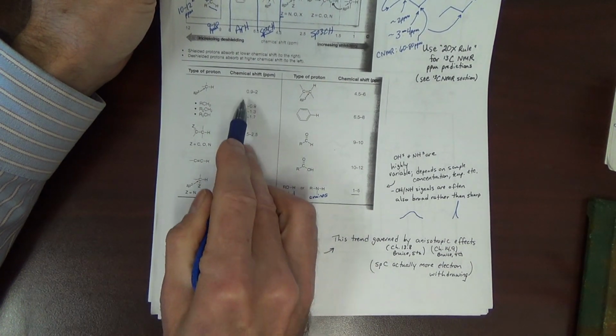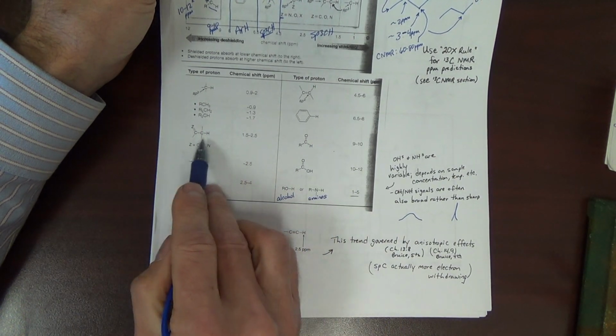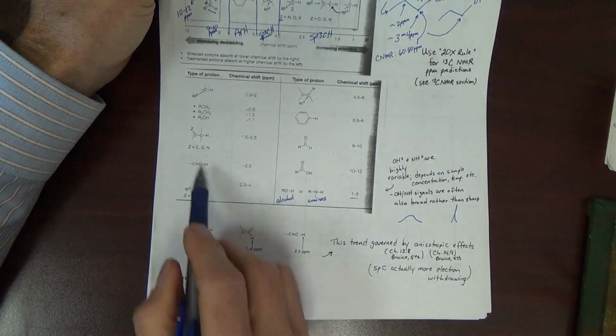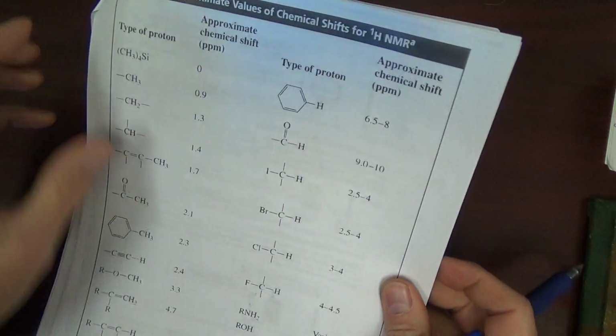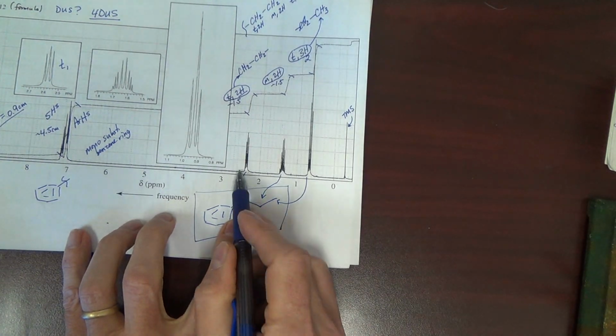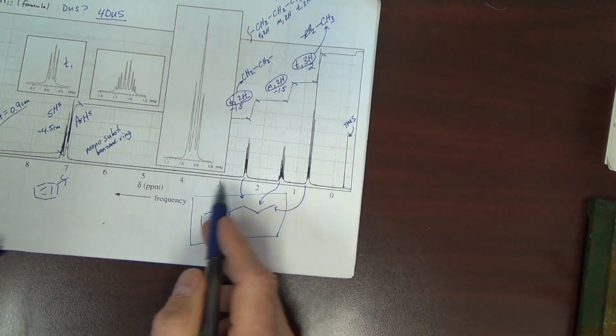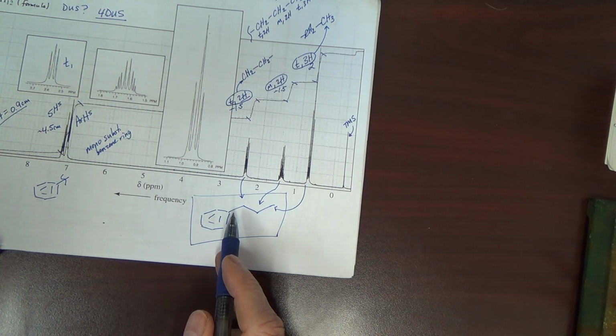Again, you can expand these always, in my mind, a little bit further. Basically, I would say about 2 to 3. And indeed, the signals for this benzylic CH2 group is about 2 to 3. All right? But again, we really didn't need to use peak position here.